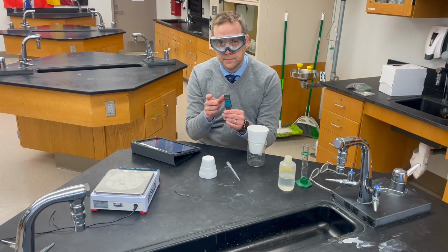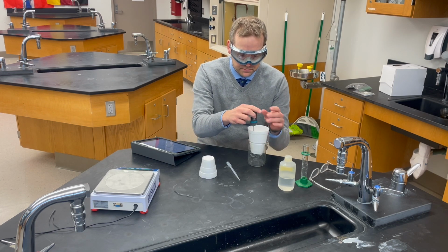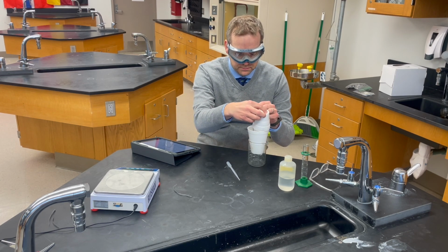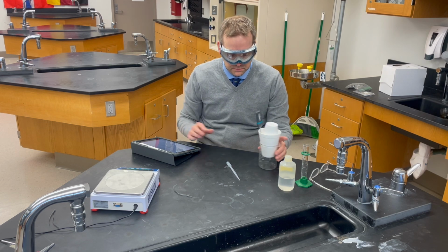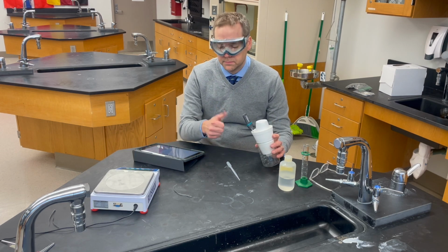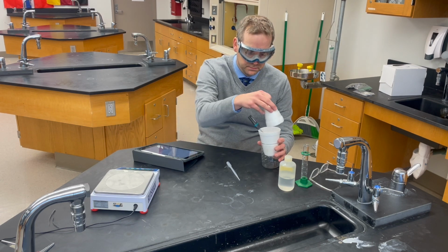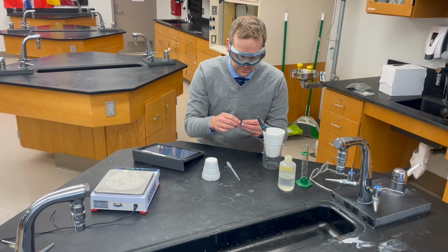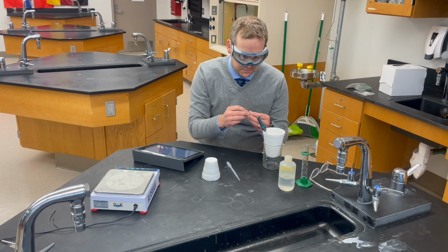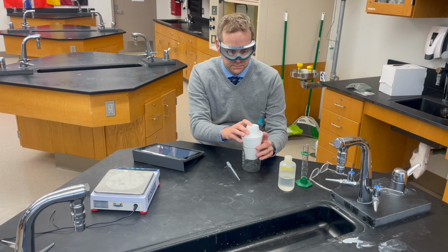Now, before the recording started, I connected the temperature probe to my iPad, so through Bluetooth they are already connected. I'm going to take the initial temperature measurement and hit collect here on my iPad to begin the experiment. Next, I'm going to take the magnesium and add it into the hydrochloric acid, and monitor the temperature as the magnesium reacts with the hydrochloric acid. Put the cap on, and here we go.